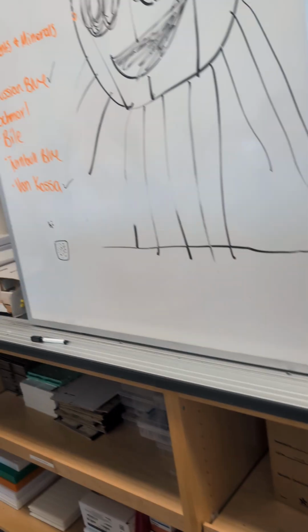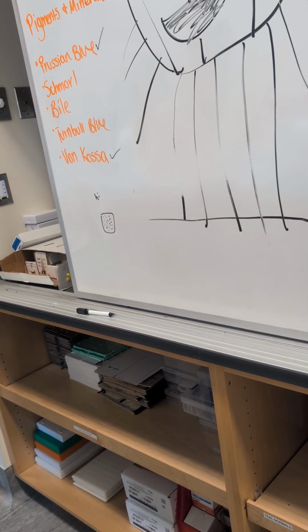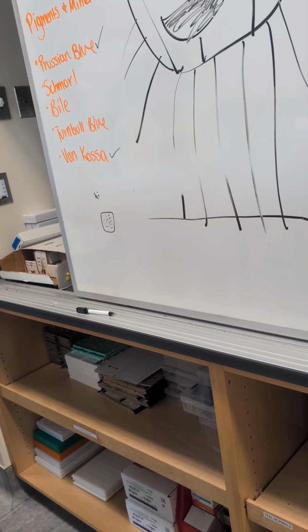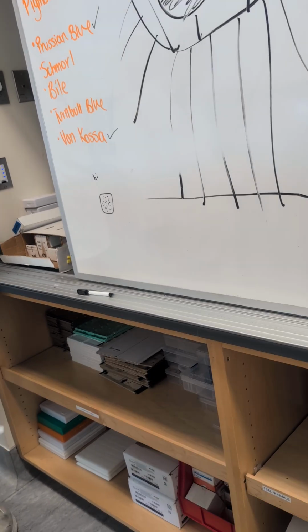Okay, so with what we're working on, should we take a tiny piece of this tissue? Yes, because it's a POC, so it's a huge cluster of all of it too. Is there a time frame where it's a POC as opposed to a fetus? Yes, but we're not involved with that.